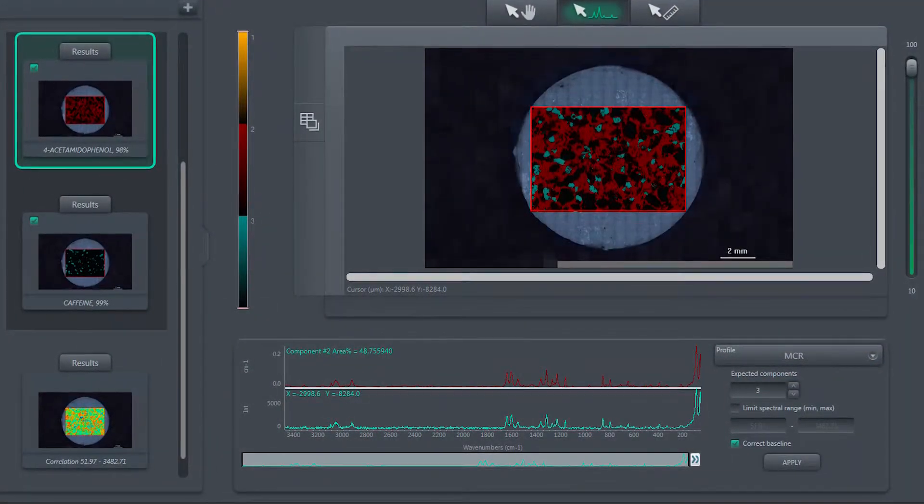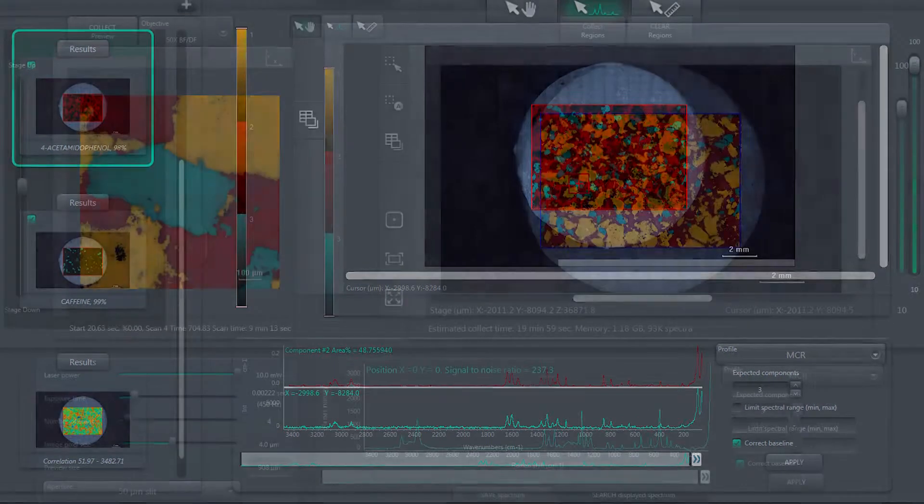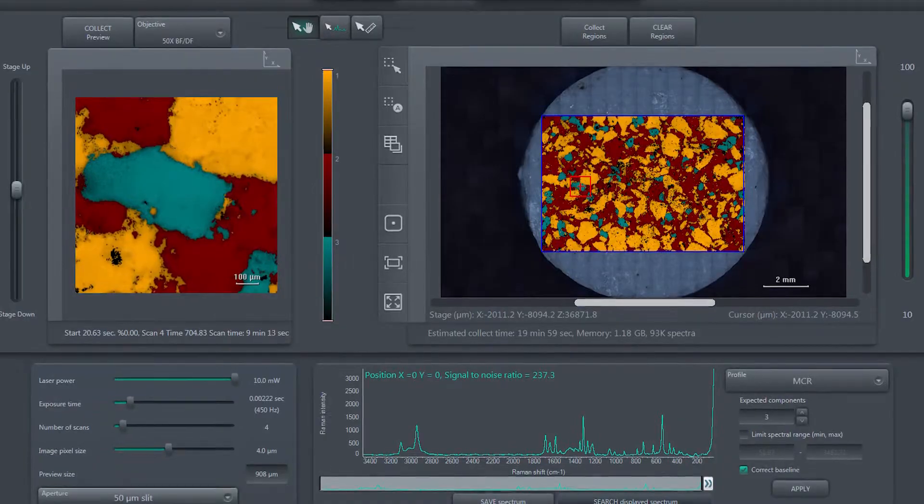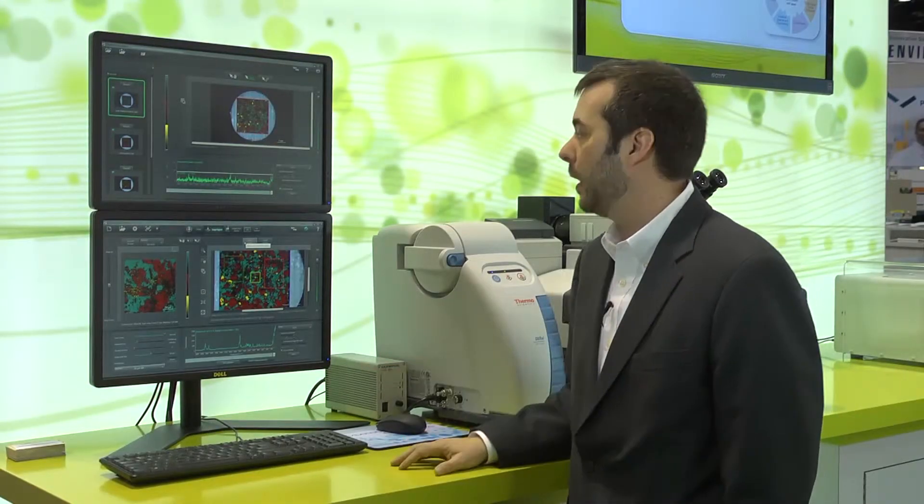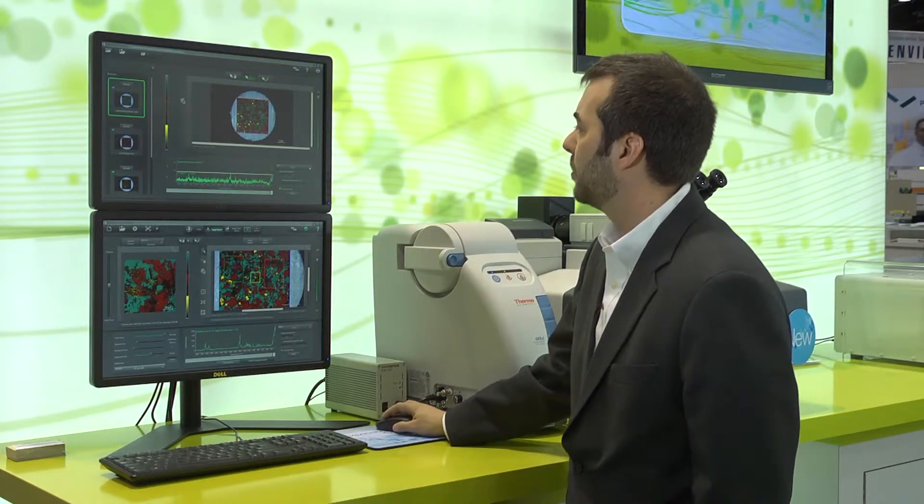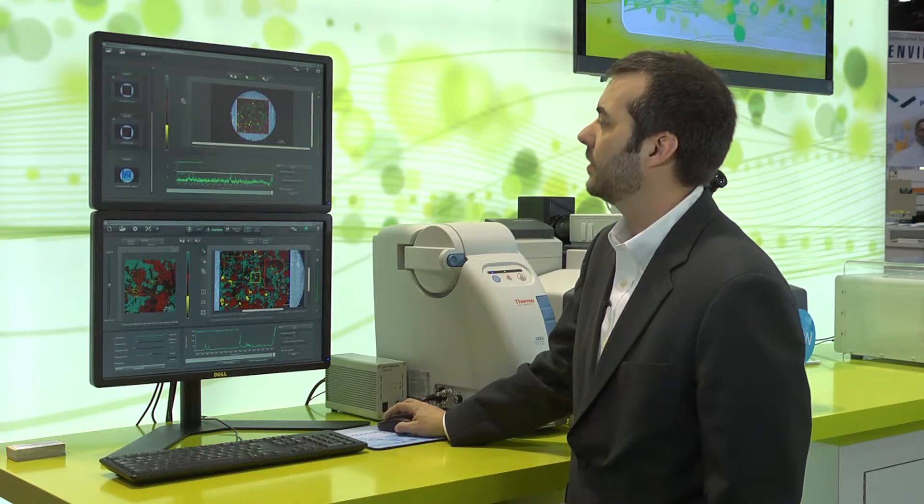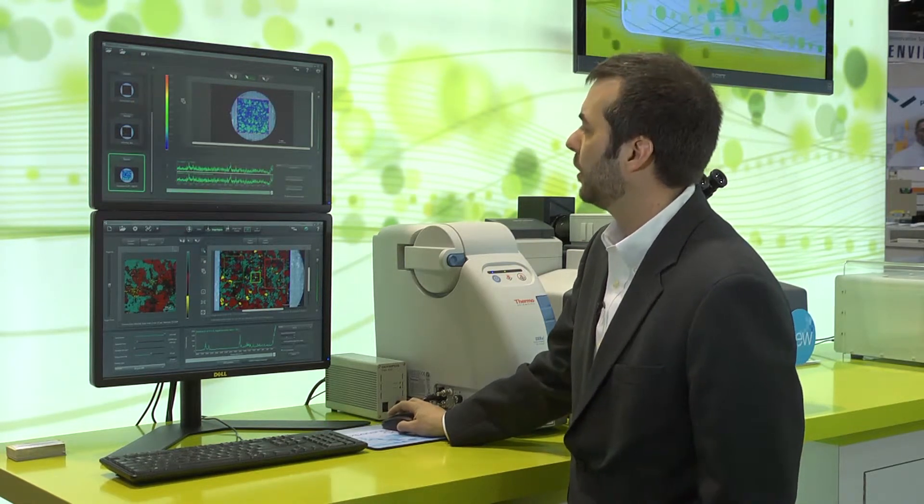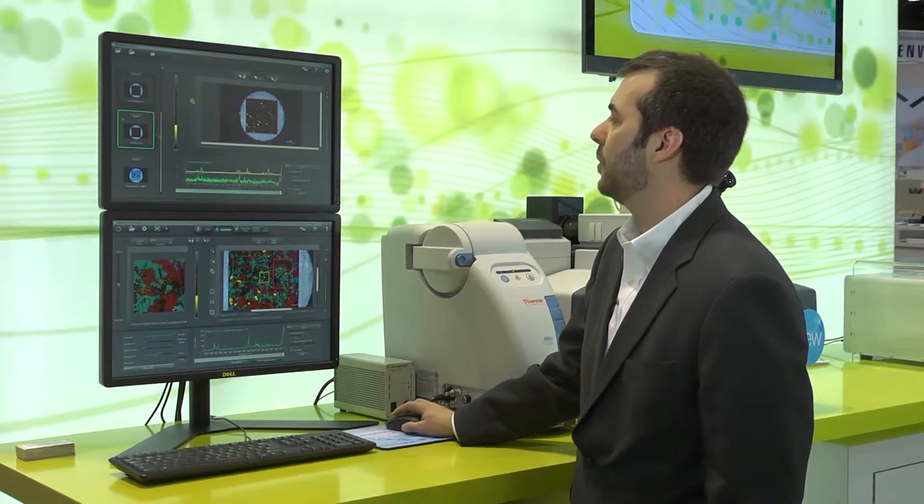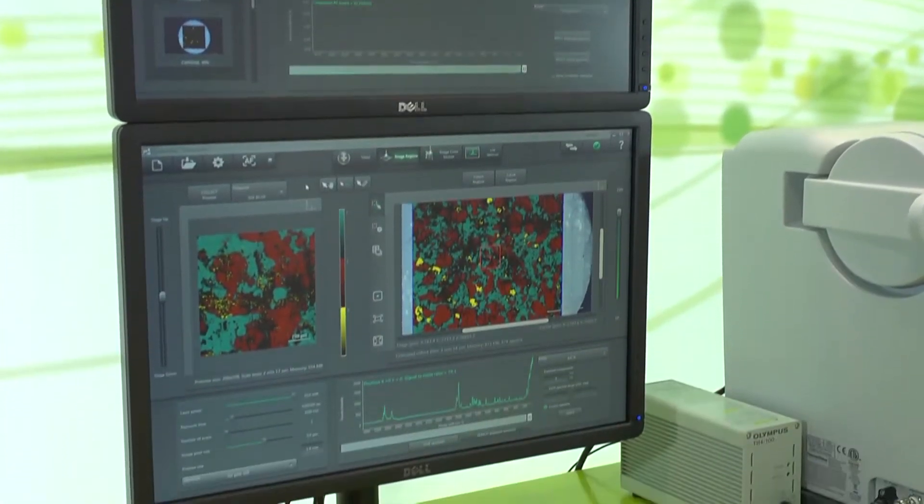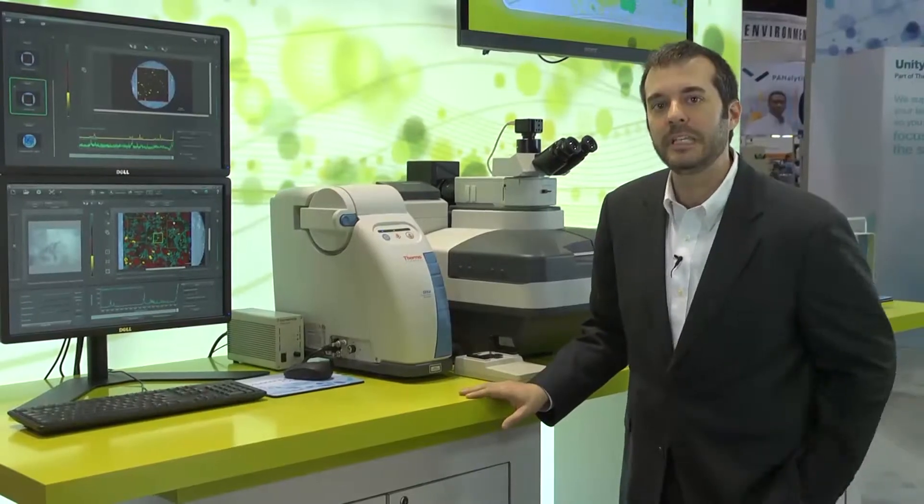We're also showing how you can perform many different experiments after the data has been collected to do analysis or post-processing, interpreting the data in many new and different ways. That's as simple as just selecting a few parameters that allow you to refine exactly what you're looking for, look at different spectral features, for example, and really gain a visual understanding of your image.